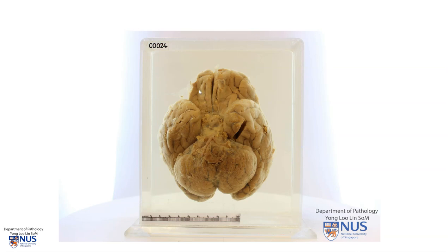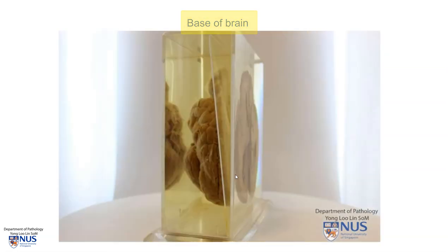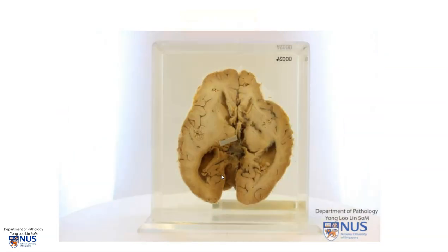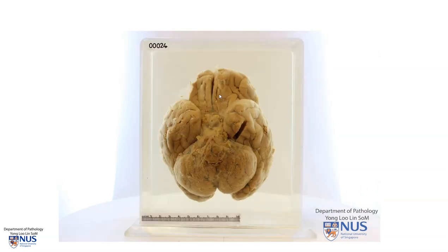Hello, this is a gross pathology specimen showing the base of the brain. And turning this around, we can see the ventricular system. The ventricles appear to be somewhat dilated. But the main pathology that we're going to focus on is seen best at the base of the brain.